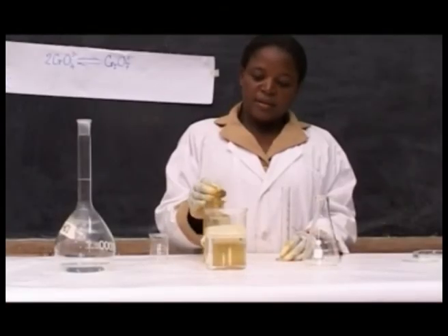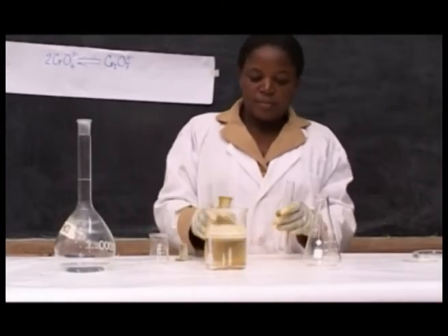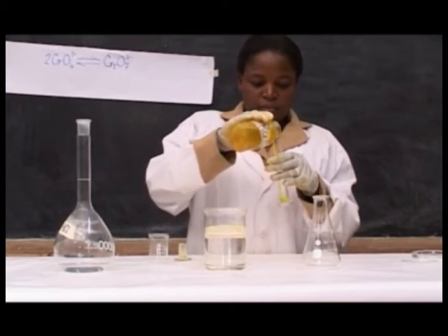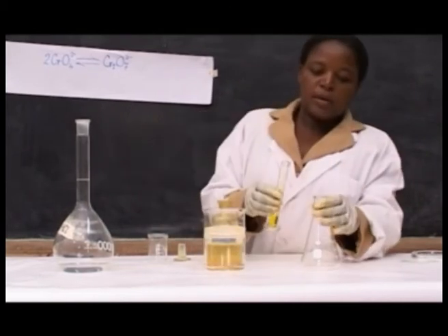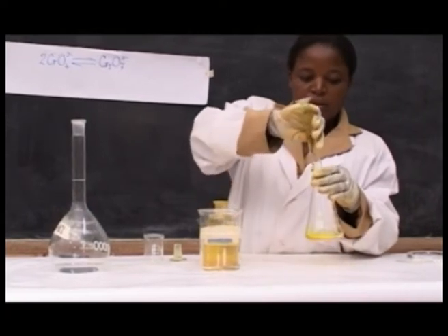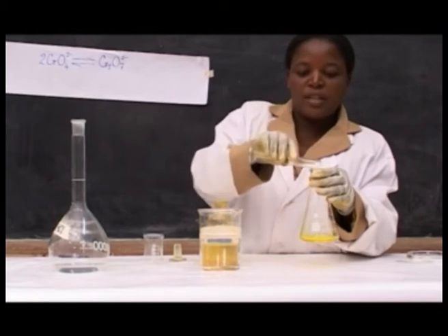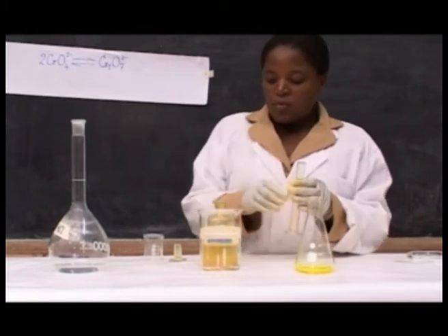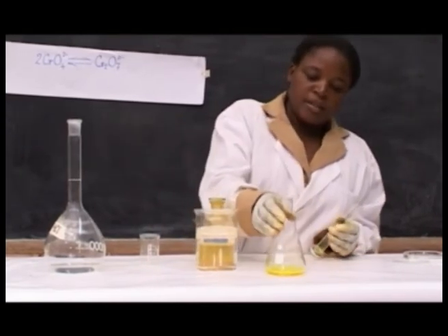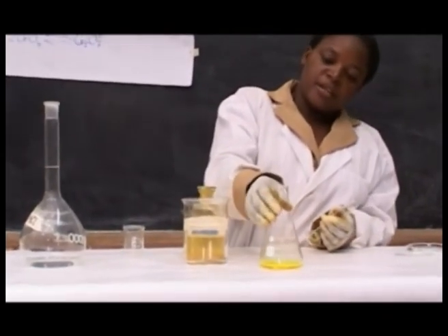Take 5 ml of potassium chromate and pour it into the conical flask. Observe the color of potassium chromate. The color is yellow.